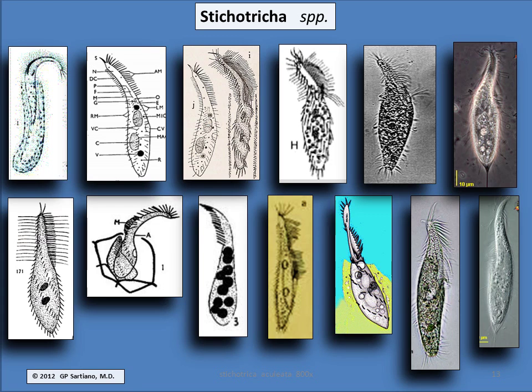There are a number of drawings and photomicrographs of Stichotricha in the literature and on the internet. They all share a number of features in common.